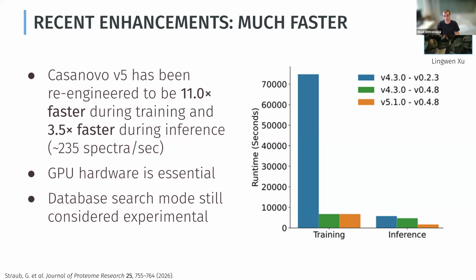Because most new deep learning architectures and models are first introduced on either images or natural language, or maybe speech, and that's what most benchmark or traditional training data sets consist of, which makes sense, because we're all naturally familiar with images and text, and you don't need to study that first. Whereas here we're dealing with mass spectra. These are complex data types that AI researchers don't know how to interpret.